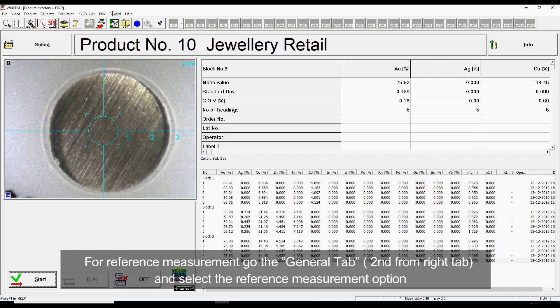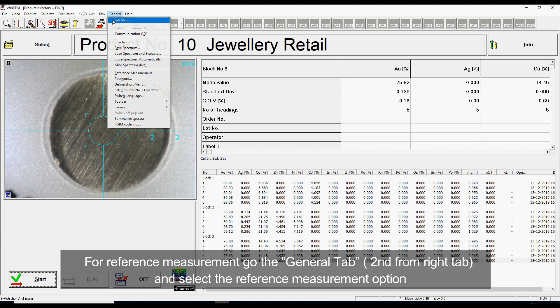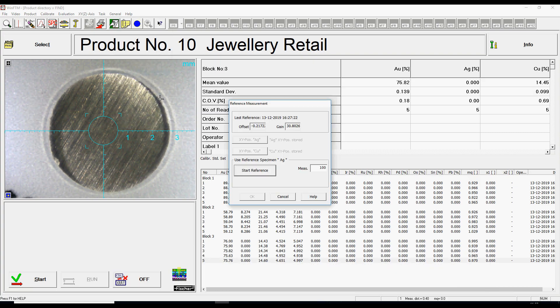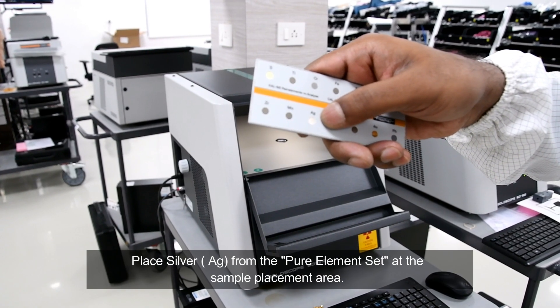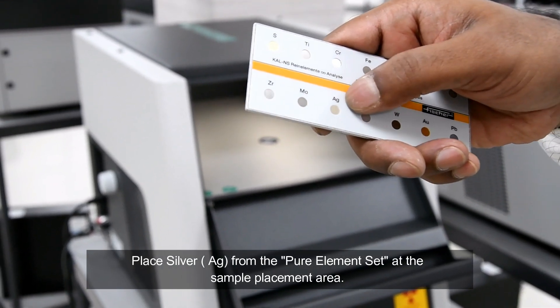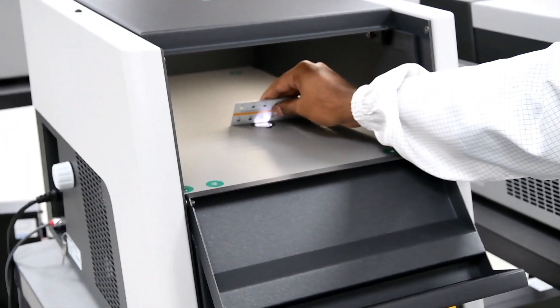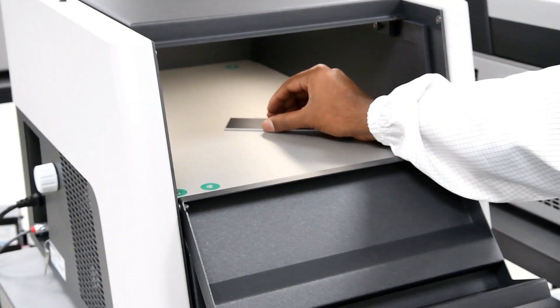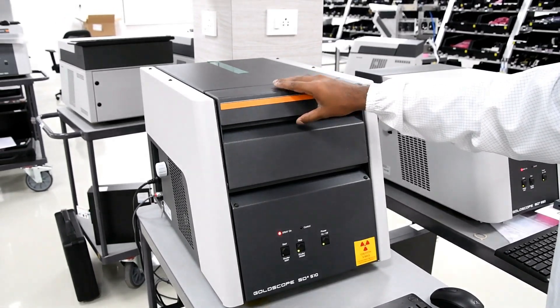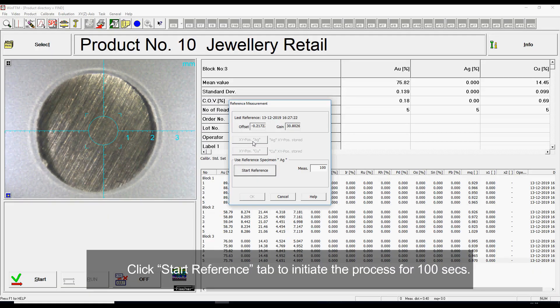For reference measurement, go to the General tab, 2nd from right tab, and select the reference measurement option. Place silver from the pure element set at the sample placement area. Click the Start reference tab to initiate the process for 100 seconds.